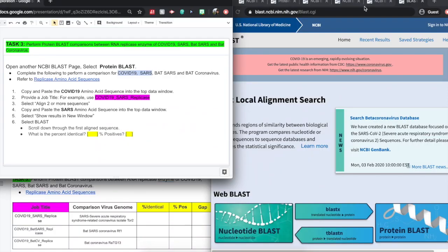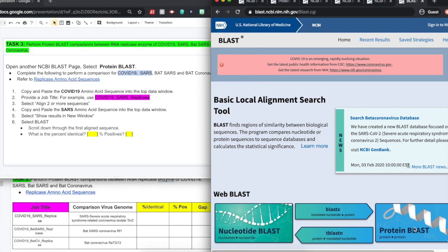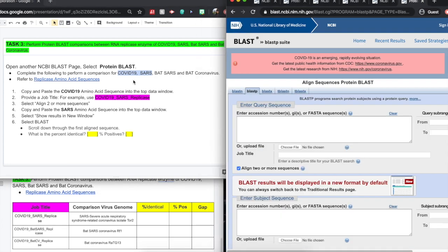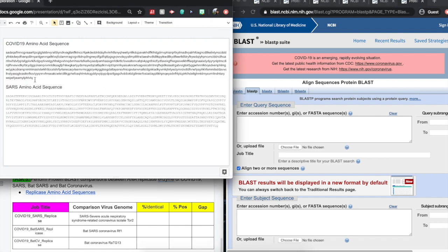For task three, we're going to open up another NCBI page, but this time we're going to select the protein BLAST. We will be performing a protein BLAST comparison between RNA replicase enzyme of COVID-19 against SARS, BAT-SARS, and BAT-Coronavirus.